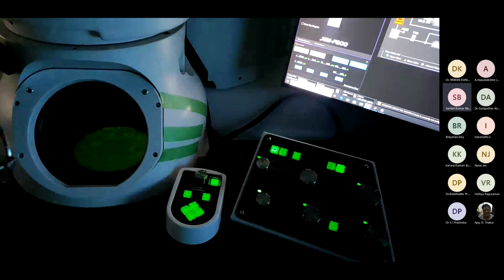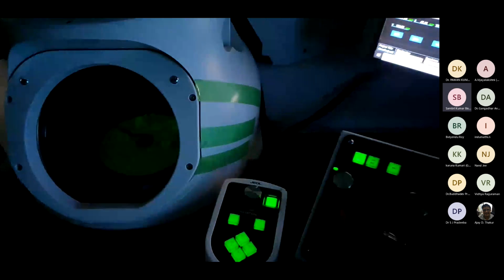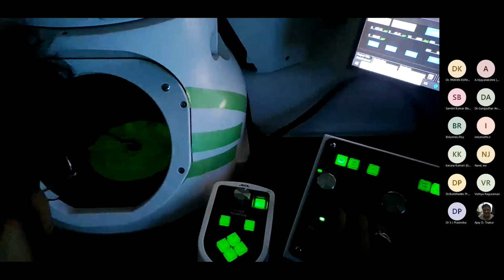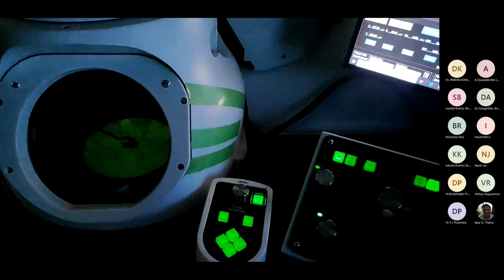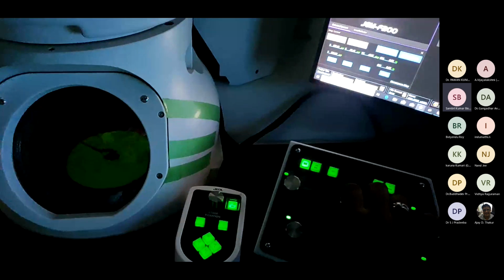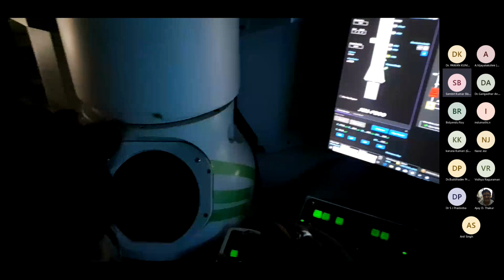Ensure we can insert the small fluorescent screen, this one. So it takes a bit of time to focus. Yes. So HT wobbling is done. Now again I'll use the magnification. I'll go from 200K to 400K and we'll repeat the same thing. I'll do the beam centering and the HT and image wobbling.